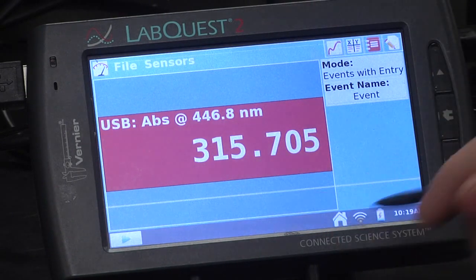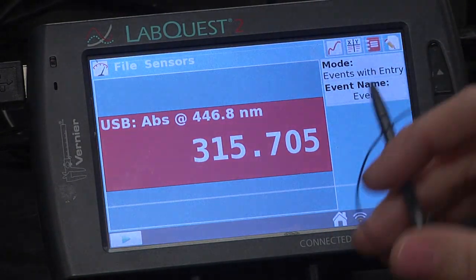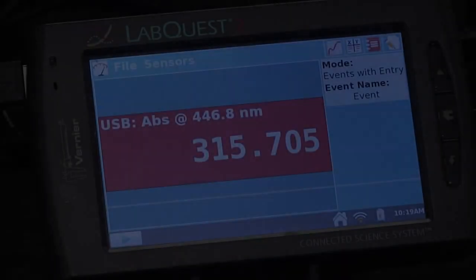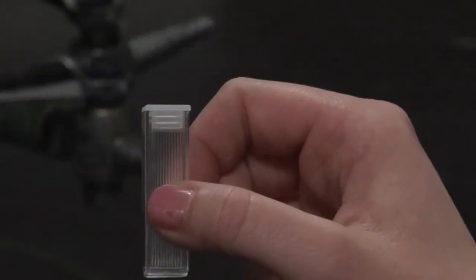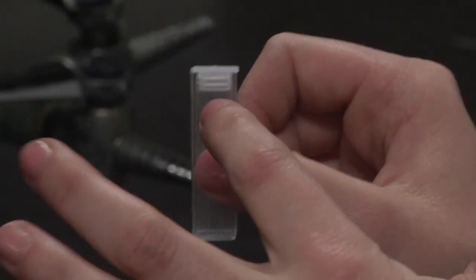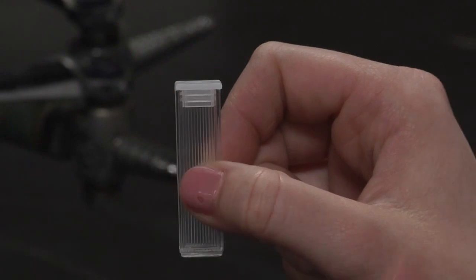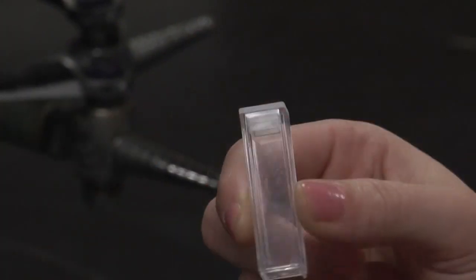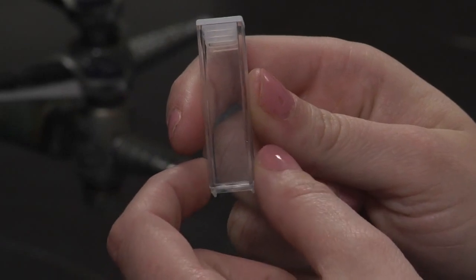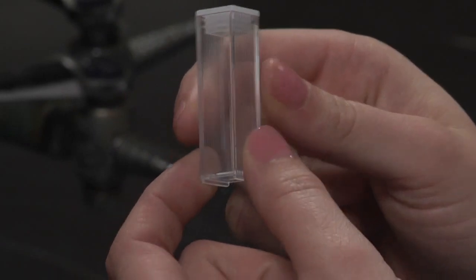To do that, you're first going to take a cuvette. Whenever you're handling a cuvette, always make sure you're touching only the ridged sides of the cuvette, because the light travels through the non-ridged side. Even the oil from your fingers can obscure the path of light.